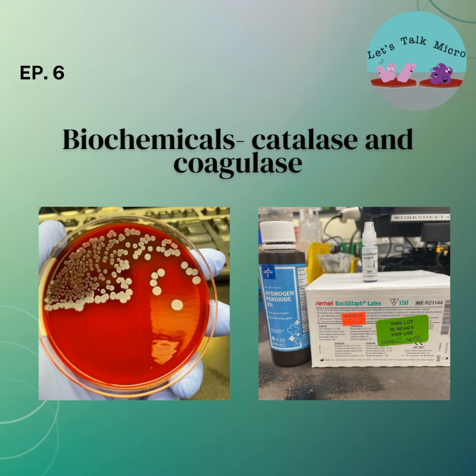So when you have bacillus, you need to rule out anthracis. If you have a non-hemolytic bacillus, you look for motility because bacillus anthracis is non-motile. And you can do it different ways. I talked about how you inoculate a trypticase soy broth and then you incubate that for 24 hours.